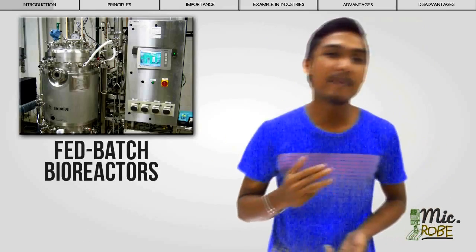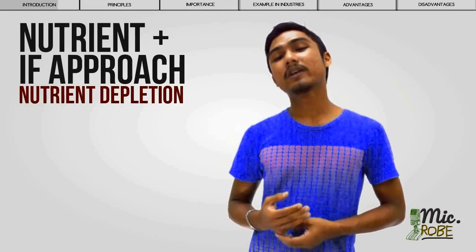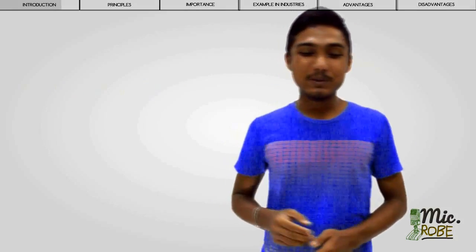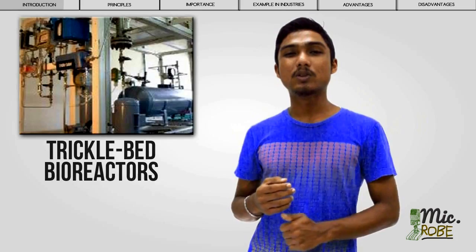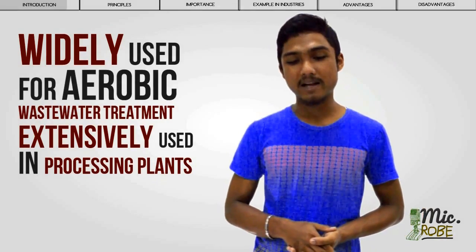We also have fed batch bioreactor. As the name goes, fed, that means the bioreactor is fed. Nutrients are added to the bioreactor if the bioreactor approaches depletion of nutrients. We also have trickle bed bioreactor, which is widely used for aerobic wastewater treatment and extensively used in processing plants.